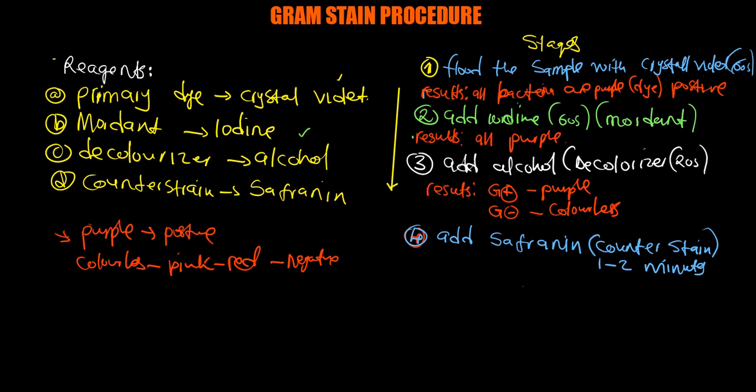So under this again, I just want to conclude, show your results now. So gram positive, it will be again purple. You get the point? Then gram negative, it will be what? Pink or red, like I described in the other part. Pink to red, like that. So meaning that they are gram negative. Okay, so that is it. Please, this is the end of the lesson.